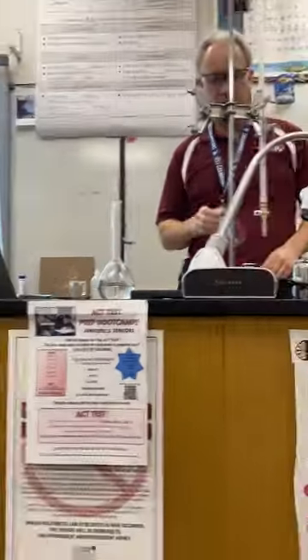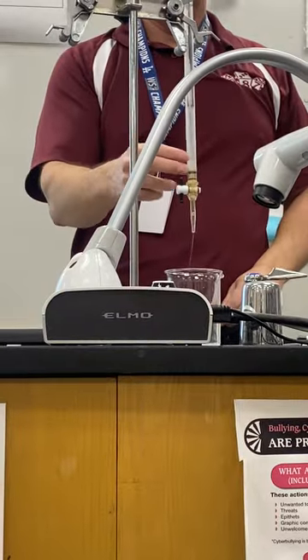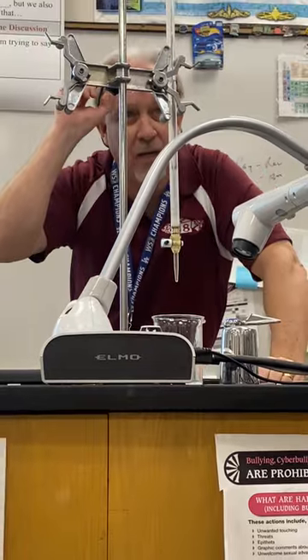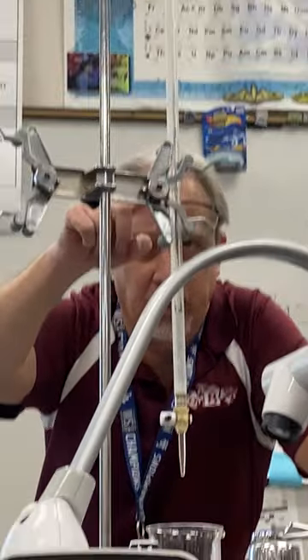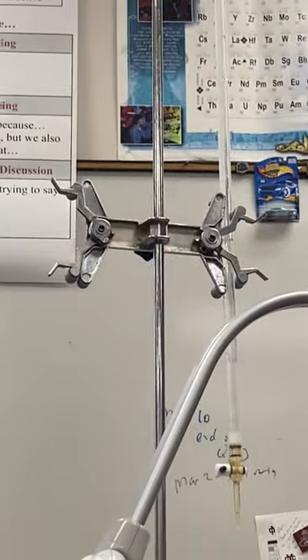Take some waste beaker, doesn't matter which one. I'm gonna run some liquid through there to get all the air bubbles out. Now I'm gonna write down the exact amount. So it's between 29 and 30, it's below 29.5. 6, 7, like 29.72.